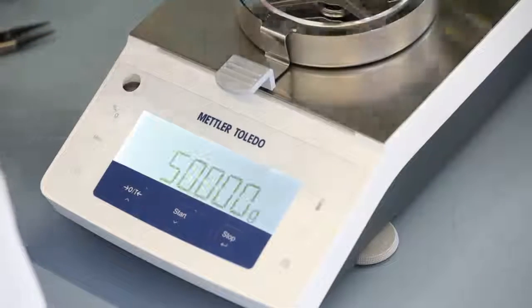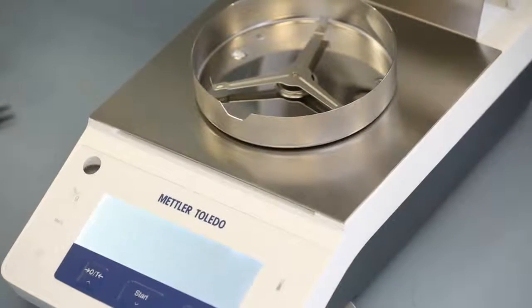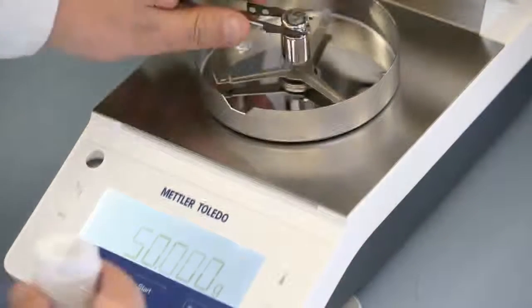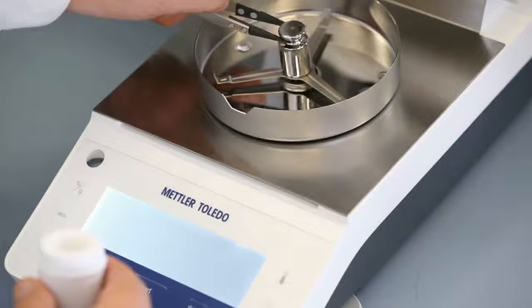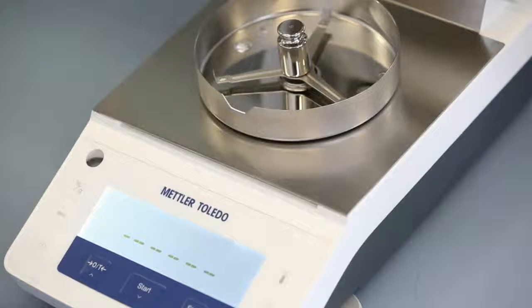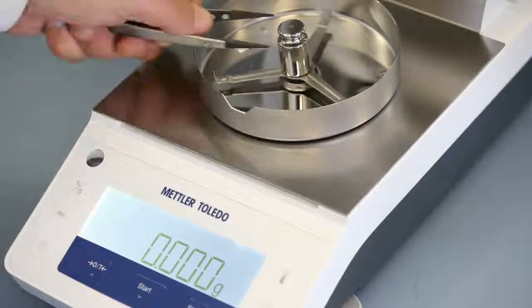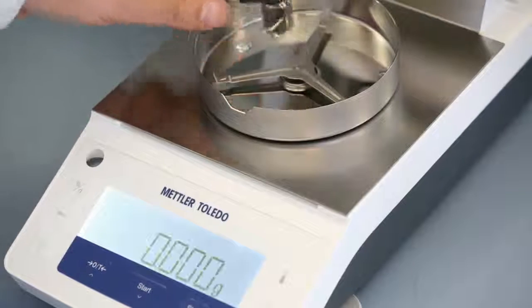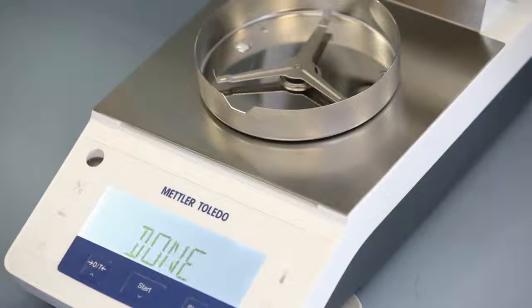The instrument instructs you to place a 50 gram weight on the weighing pan and then to remove the weight. After removal of the weight, the adjustment procedure is finished.